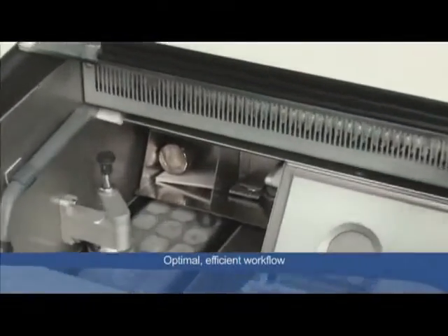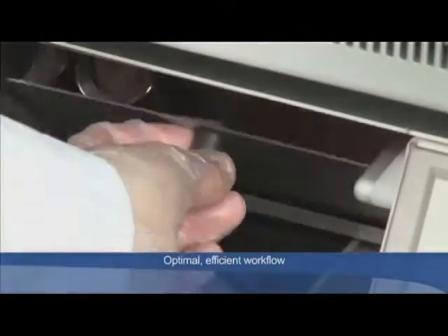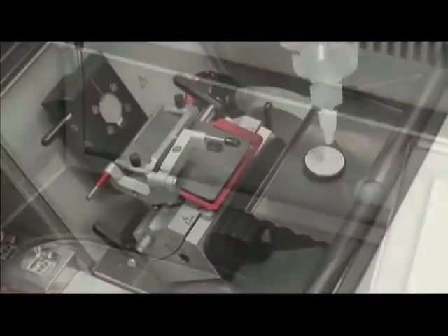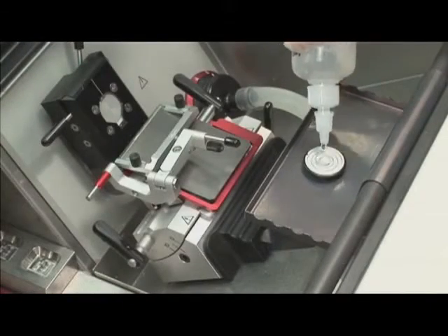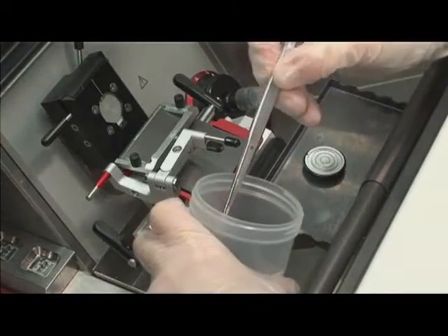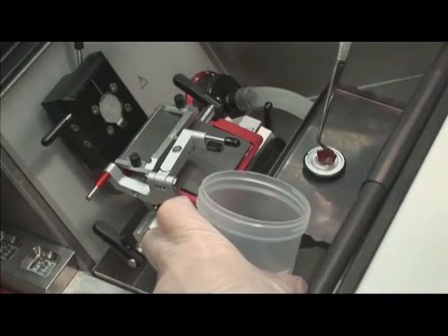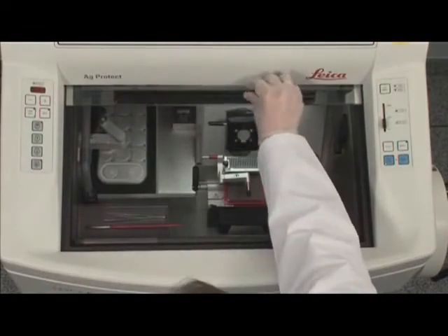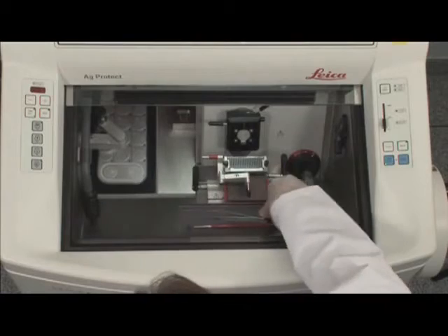The 1950 has a well-organized workspace with an integrated storage container to pre-cool specimen discs. A well-illuminated, ergonomically designed cryo-chamber allows a clearly structured workflow and the efficient handling of a wide variety of specimens.